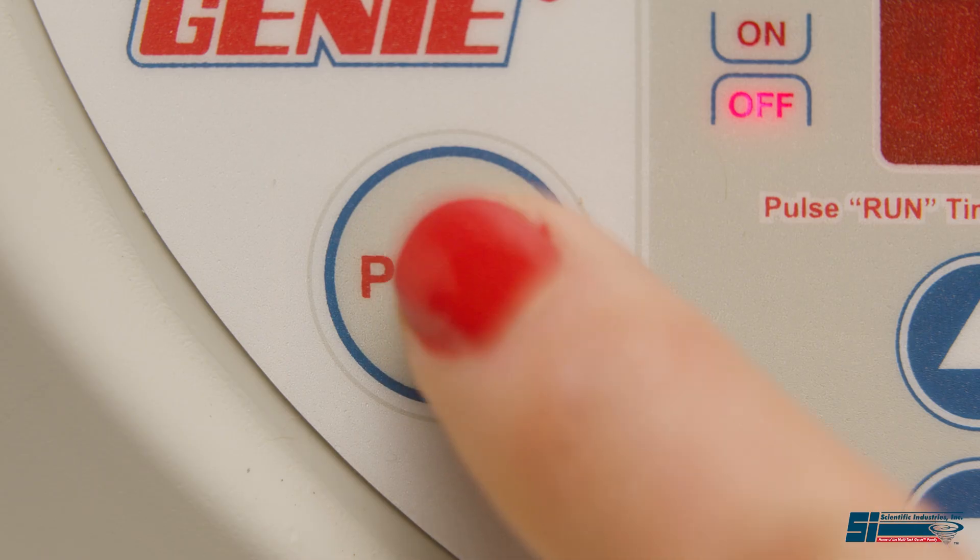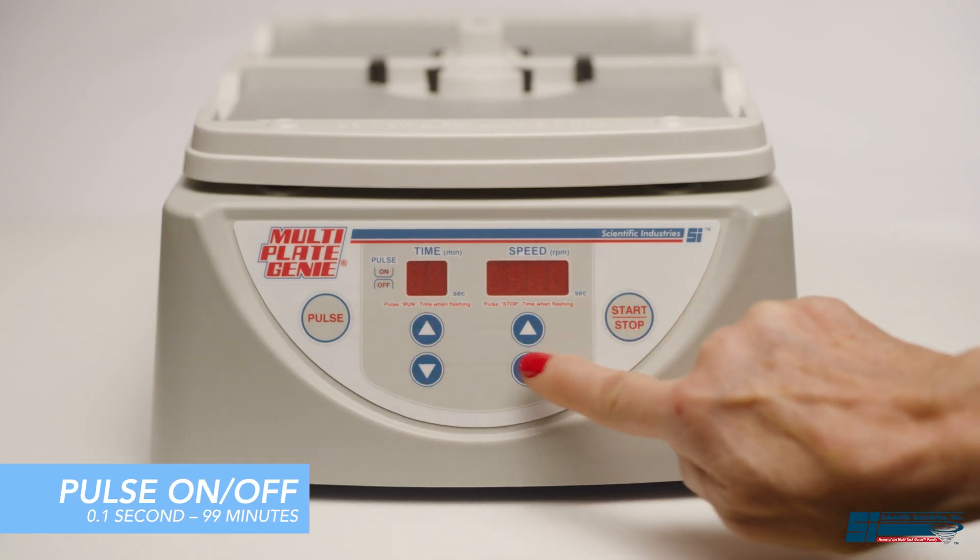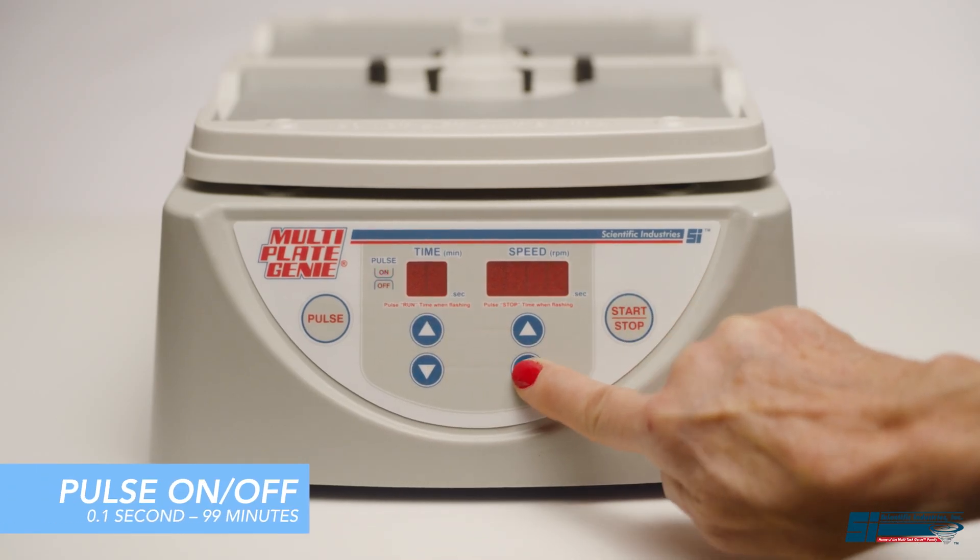Using the keypad, simply set the program into pulse mode for interval mixing. Then set the time on and time off on the keypad.